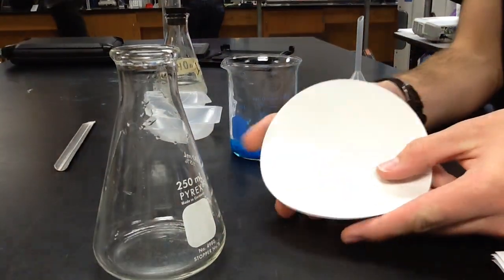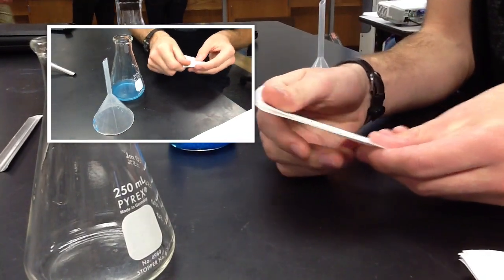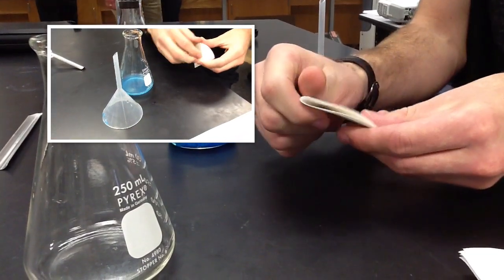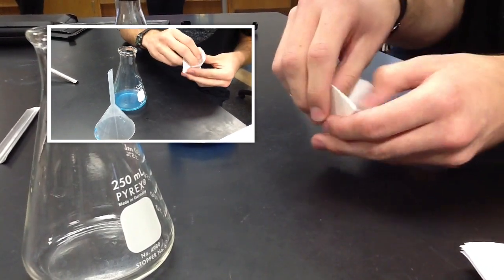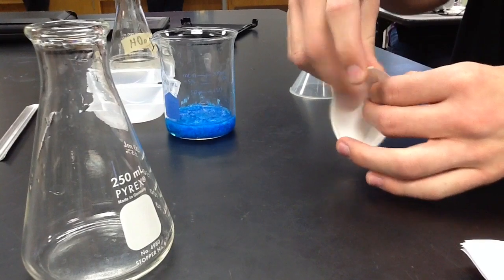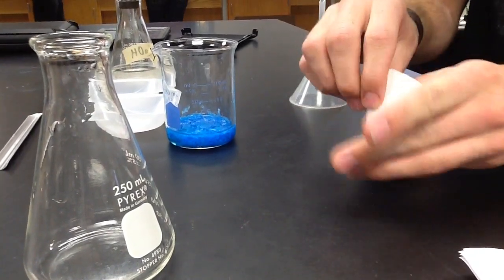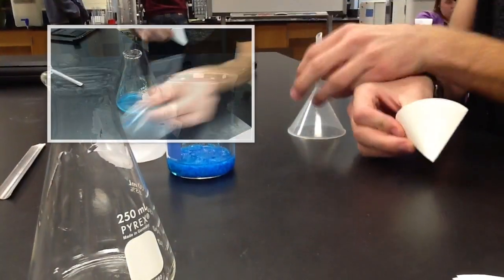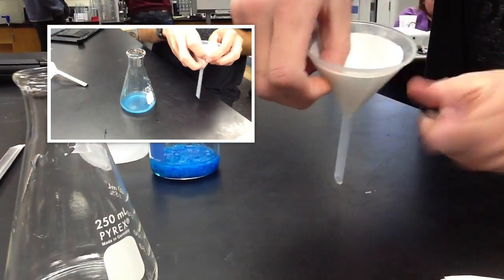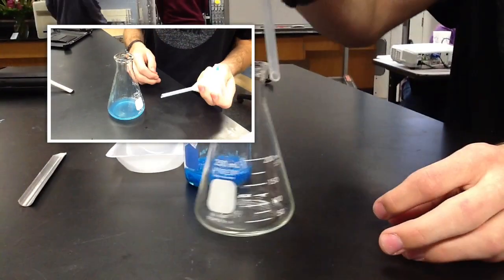To separate the product, get a filter paper and shape it into the shape of the funnel. Put the filter paper into the funnel, and once that is completed, put the funnel into the flask.